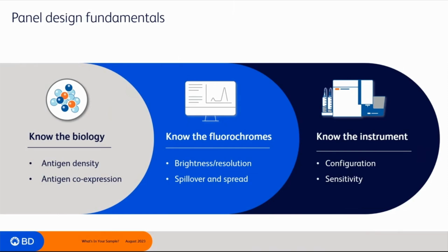The third pillar is know the instrument. You will learn about instrument-related factors such as configuration and sensitivity that can influence panel design for standardized and reproducible results. Ultimately, you will learn how to use the 3 panel design fundamentals to troubleshoot your own panels.